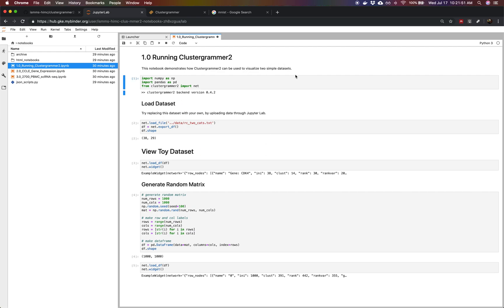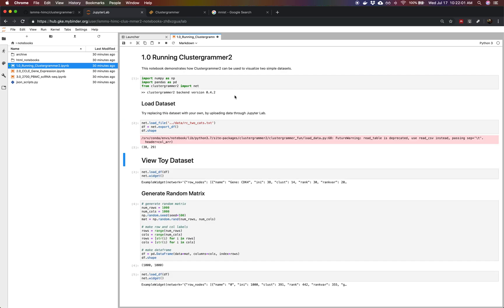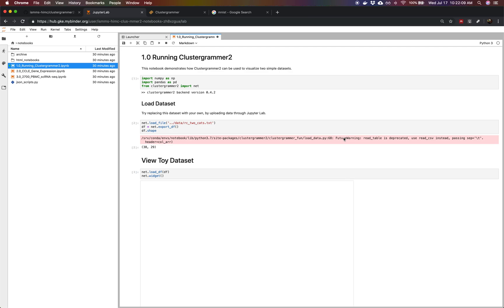If we start executing the first few lines, we are going to first import some libraries like pandas and numpy and ClusterGrammar 2. And then we're going to load an example dataset we have called rc2cats, which is a small gene expression snippet from the cancer cell line encyclopedia. And now we're going to view our toy dataset.